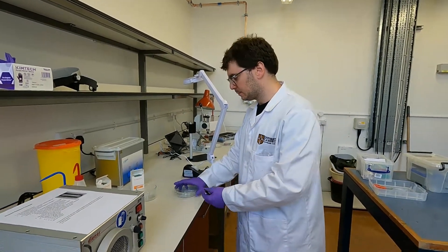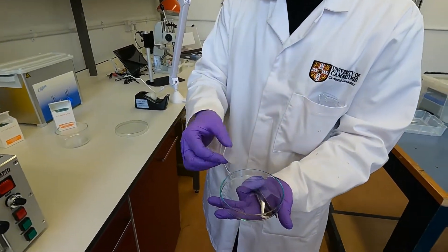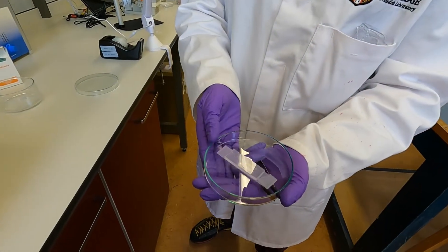Here we have the sample that has been punched. That's the PDMS chip that's been punched with all four holes for the four inlets.